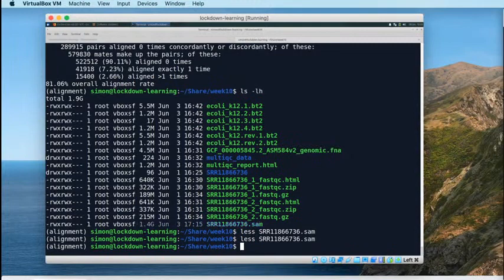So it's 1.4 gigs on the disk. When you compare that to the size of the FASTQ input, so 189 meg for the first in pair, 215 meg for the second in pair, clearly the SAM file at the moment is considerably larger than even that combined input.